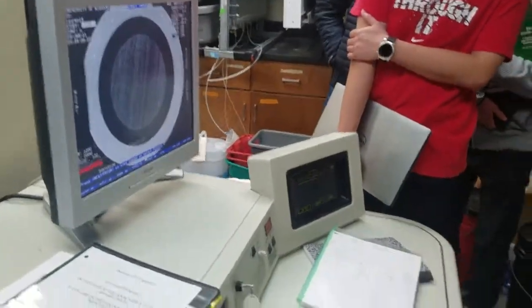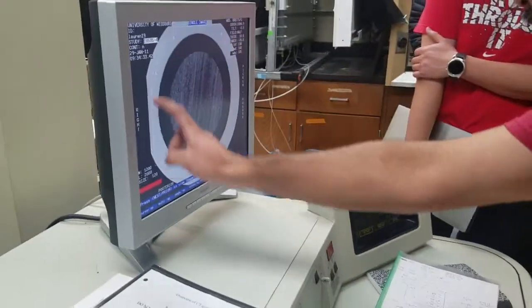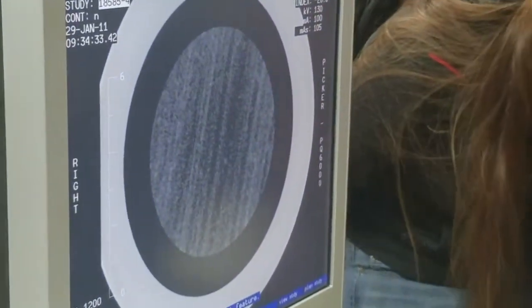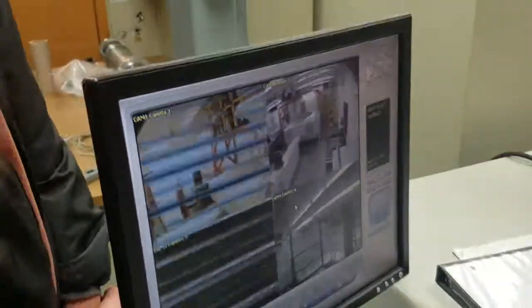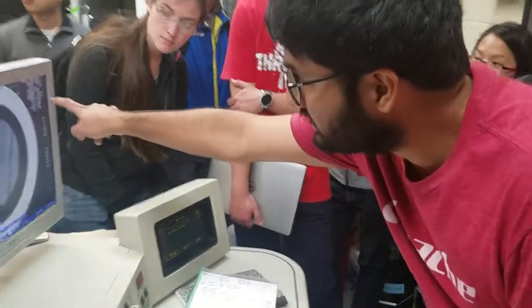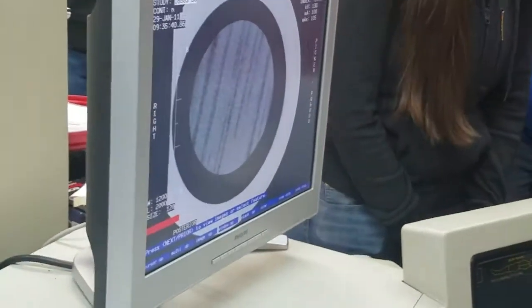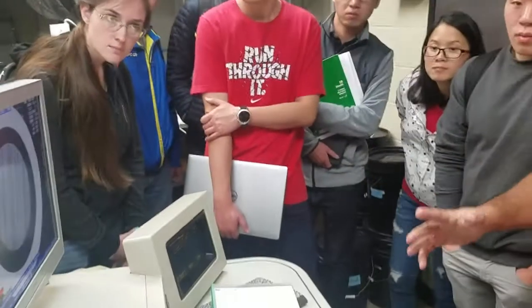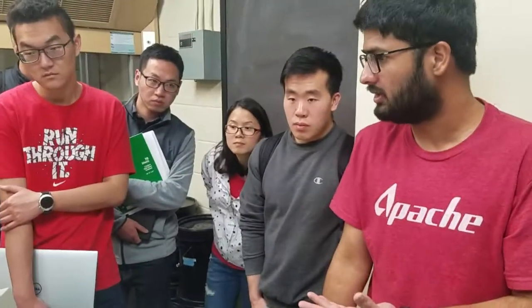Yeah, there's a USB interface. So these are different scans that we take. This is the core holder. This is the core. How many slices? For this one, 30 slices. Each slice has a thickness of 10 millimeters. Basically each scan thickness is 10 millimeters, and after each scan it moves 20 millimeters. So it's not a continuous scan for the whole core. It depends on what type of experiment you're running.